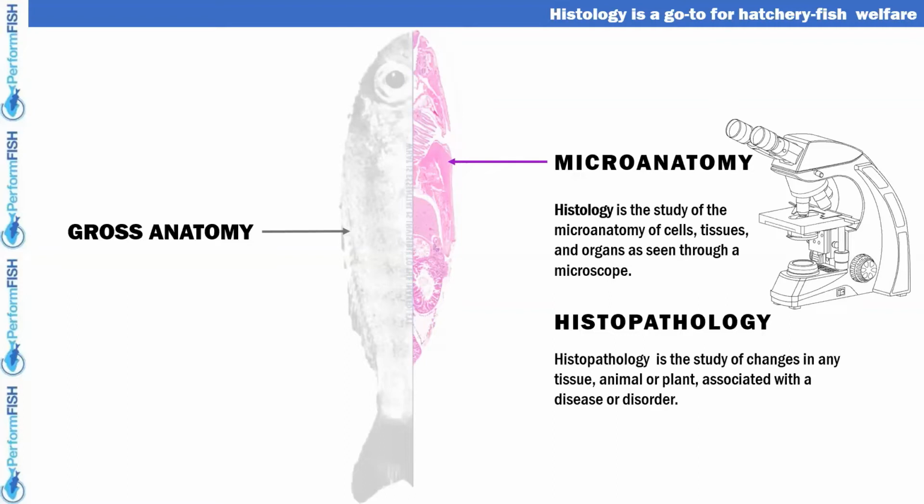Histology is a branch of biology which studies the normal microscopic anatomy of cell, tissue, and organ, looking at structures visible only with a microscope. And this is the counterpart of the gross anatomy, that is the study of anatomy at the visible or macroscopic level. The histopathology, instead, is a branch of anatomopathology that studies the changes in the tissue, in cell and organs as a result of disease processes or insults, applying histological methods, of course. And if you want to go into further detail, and so study cellular anatomy or ultrastructural anatomy, the tool is the electron microscope, using, of course, the transmission electron microscope.